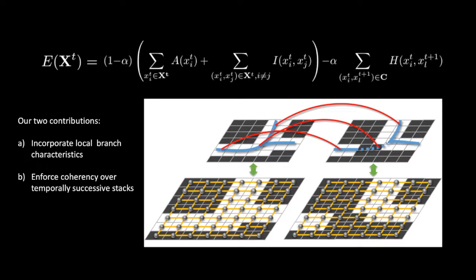Our co-segmentation framework is composed of 3 main parts. First, the data penalty term is the cost of labeling voxels as neurite or background, independently from the spatio-temporally neighboring voxels. Second, the smoothness penalty measures the cost of assigning different labels to 2 neighboring voxels within the same stack. Last, the tree similarity function H encodes the tree structure coherency of the neurite across image stacks.